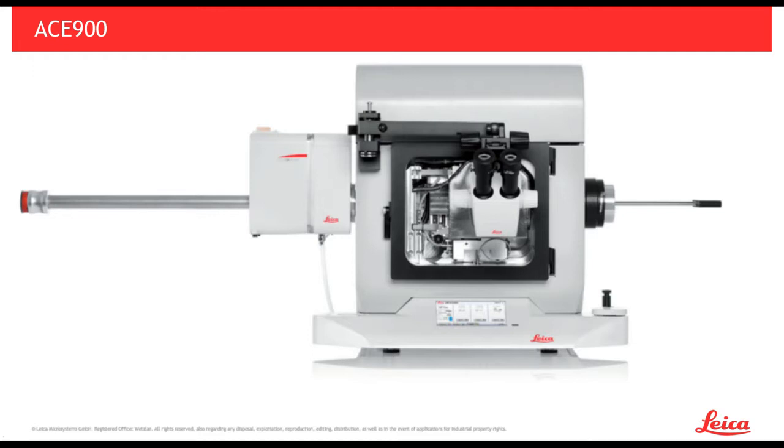Why do you refer to pure metal when it is a PTC shadow? Okay, that is absolutely correct that it is a platinum carbon deposition. So the E-beam actually has a carbon crucible in it, which has a piece of platinum in it, and that's what deposits onto the sample.